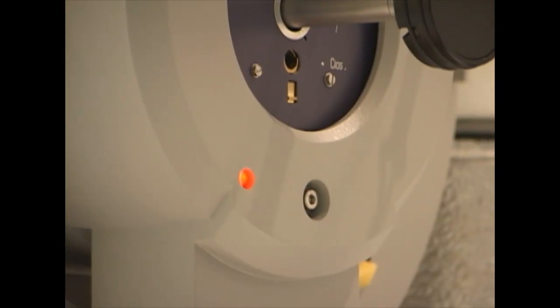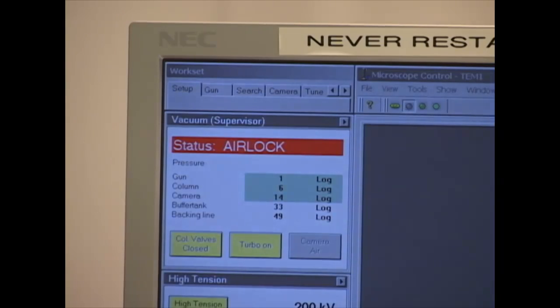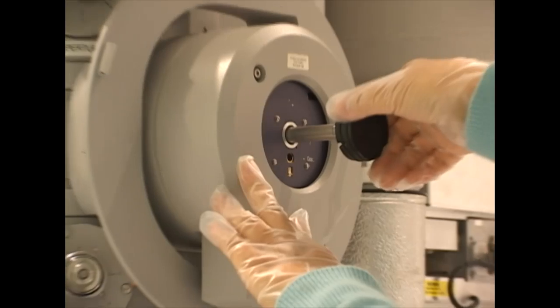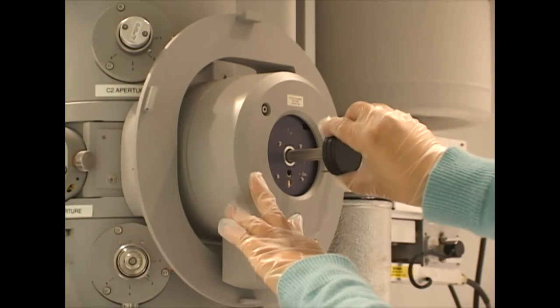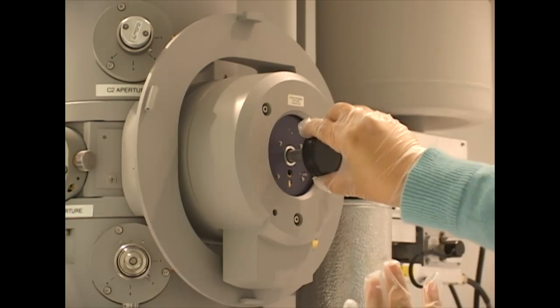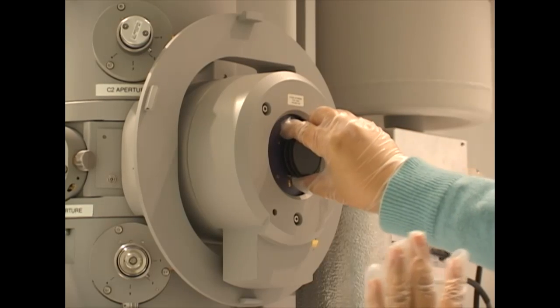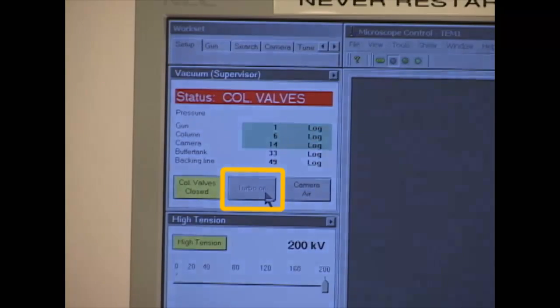When the light goes out and the airlock status changes to Column Valves, the sample chamber has been evacuated. Now, turn the holder counterclockwise and hold it as the vacuum sucks the holder slowly in. Now, turn off the Turbo Pump.